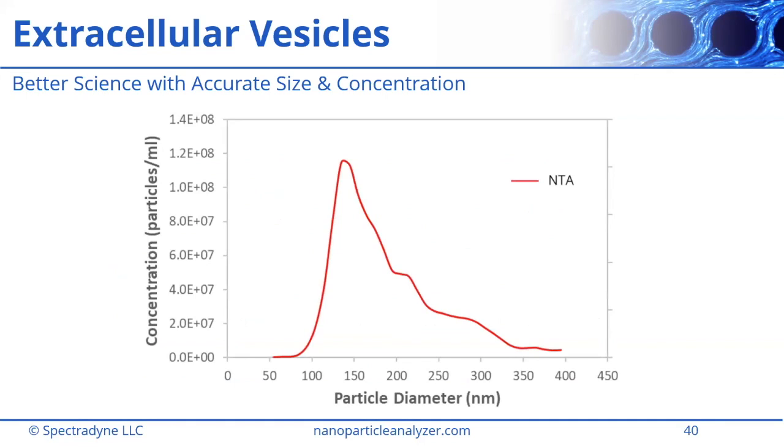So let's start again with NTA because it's very popular in the extracellular vesicle world. And we'll take it again from a scientist's perspective, where I've measured this EV sample, purified my EVs, and measured them by nanoparticle tracking analysis. And this is the data that I received. If you're a scientist and you see this data, you get pretty excited because we've got a nice peak in the size distribution. It looks very promising.